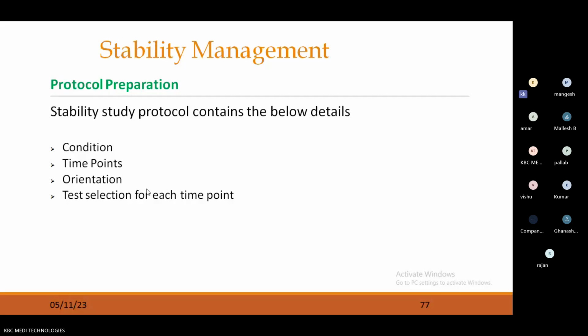Normal indicates FP product related master data preparation. Stability product master data preparation will be slightly different. Wherever stability indications are required, we need to do some additional configuration. So those configuration controls I will elaborate going forward. Okay.